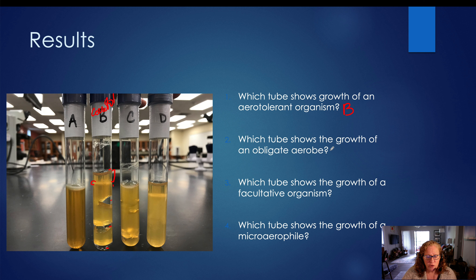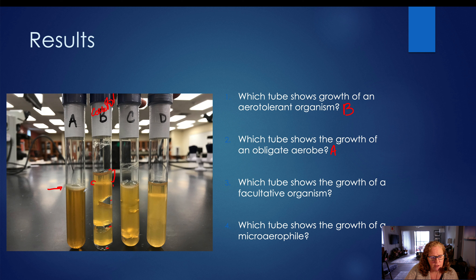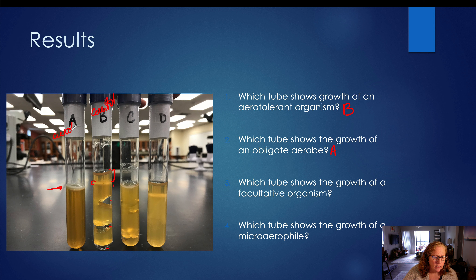Which tube shows the growth of an obligate aerobe? The answer is tube A. If we take a look at tube A, we have a white film on the surface — lots of growth on the surface. Once we get below the surface, we don't see any growth. The tube is very clear throughout the rest of it with no cracks, no air bubbles, no cloudiness. So this organism is only capable of growing in the presence of high levels of oxygen; it must have oxygen for growth and lots of it.